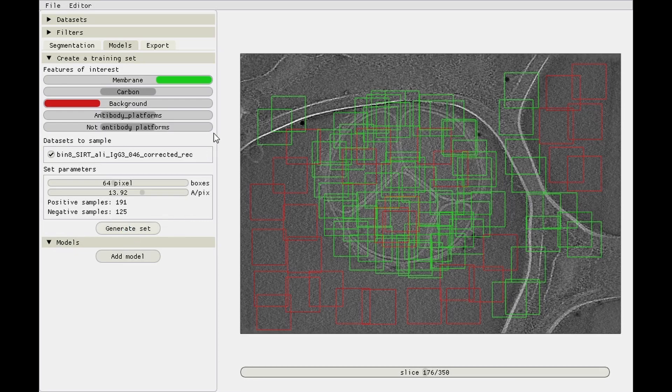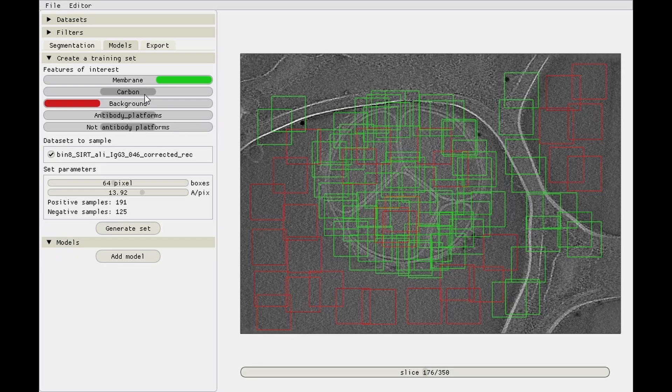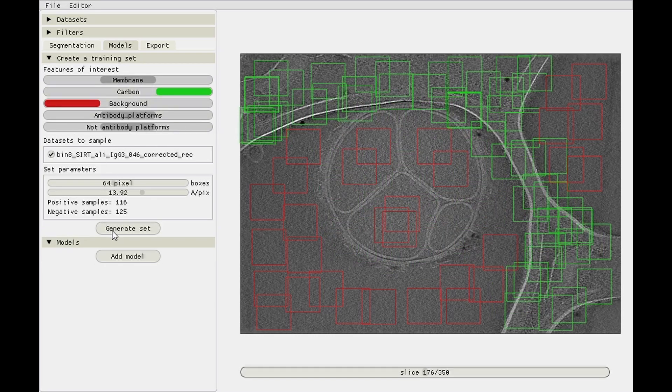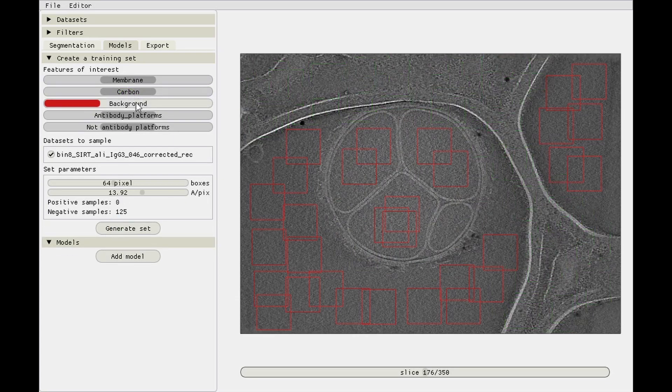So generate set, save it somewhere you can find it, and then onto the next one. Carbon, again carbon as a positive, background as the negative, and save it somewhere.